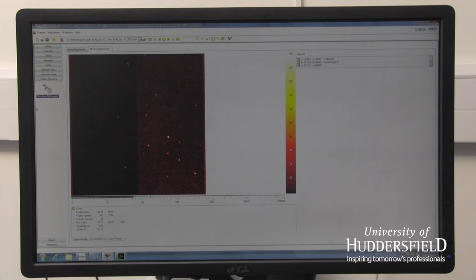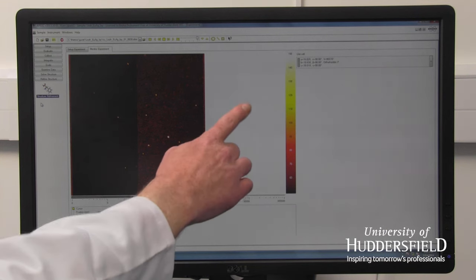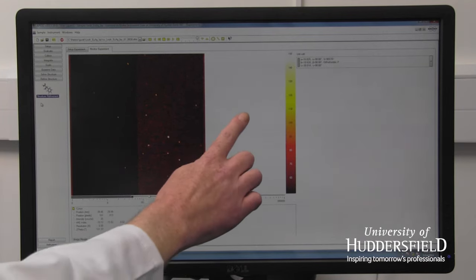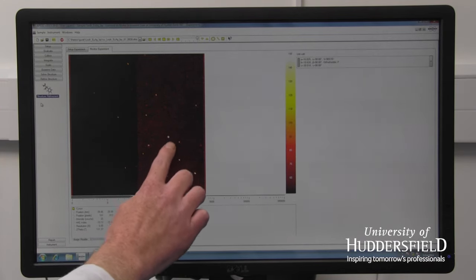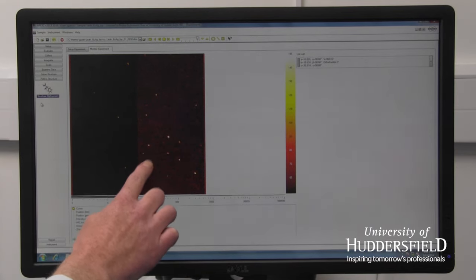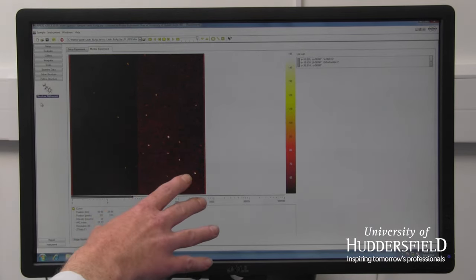Here you can see the results of your experiments. If you imagine in the machine, your crystal is about here, and the X-rays are coming in and being diffracted. These bright spots here are where the X-rays are being diffracted to. And their position and their intensity is all very important.